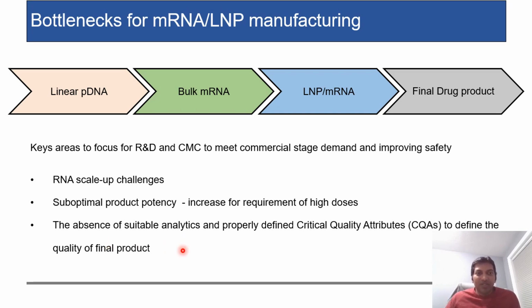For this specific talk, I'm going to focus on the suitable analytics and properly defined critical quality attributes, and what attributes and methods are applied for these lipid nanoparticles. So before I talk about those, I would like to talk about these critical quality attributes. What are these and how did FDA define them?